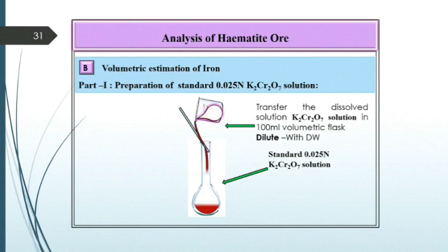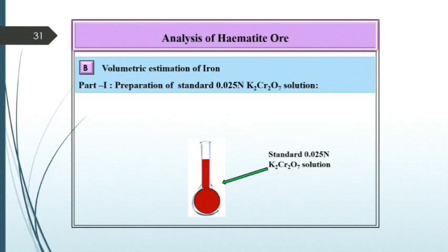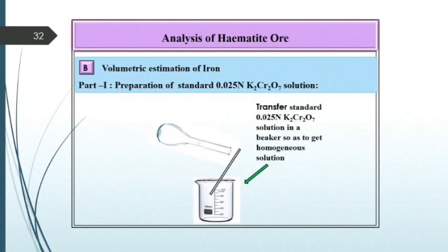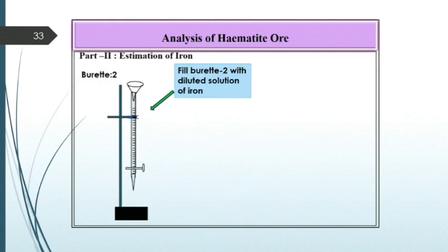Transfer this K2Cr2O7 solution in a clean and dry 100 ml volumetric flask and dilute it with distilled water. Now transfer this prepared 0.025 normal K2Cr2O7 solution in a clean and dry beaker so as to get a homogeneous solution. So this is Part 1, preparation of standard solution of 0.025 normal K2Cr2O7 solution.